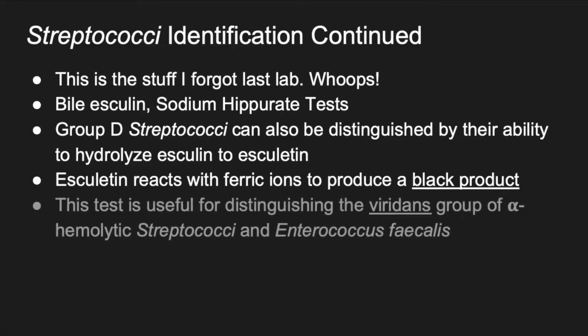This test is useful for distinguishing the viridans group of alpha hemolytic streptococci and Enterococcus faecalis. So this test is very useful in distinguishing between the two groups that we're looking at right here, alpha hemolytic streptococci and Enterococcus faecalis.